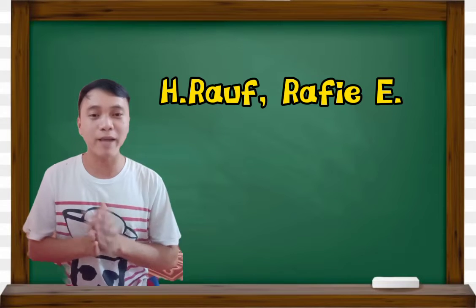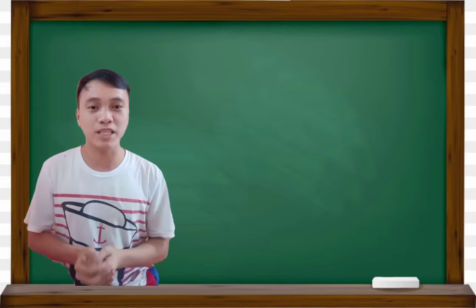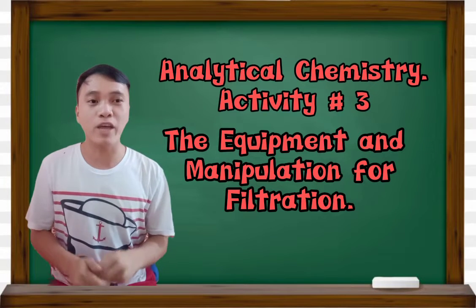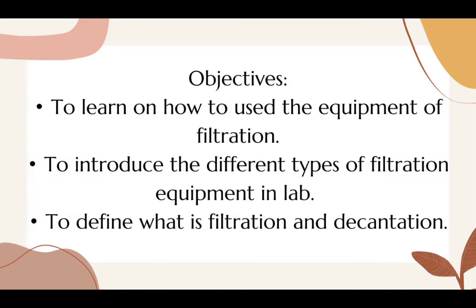Hello everyone, I'm H. Rauf, and for today's video, our third activity in analytical chemistry, which is the equipment and manipulation for filtration. My objectives are to learn how to use the equipment of filtration, to introduce the different types of filtration equipment in the lab, and lastly, to define what is filtration and decantation.